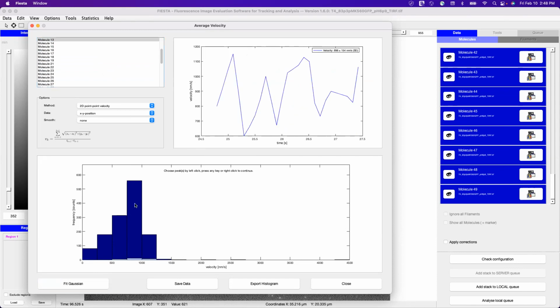I guess you then fit a Gaussian to your actual data. My computer's really struggling. If your computer isn't lagging behind, you could then do your Gaussian fits, but again, I'd probably recommend just doing it in MATLAB anyway.